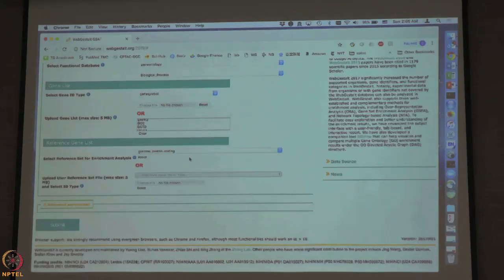So for a lot of proteins you didn't have the opportunity to get the statistics, and then you should limit your search space, or the background reference space, to those proteins you can actually analyze. This is very, very important. I review a lot of papers, and in a lot of proteomic studies, they use all the genes in the proteome as a reference. That is not correct, because you can easily identify, for example, ribosome or those types of highly abundant proteins as enriched, but it's just because those proteins have a better chance to be detected, not because they are differentially expressed. Just be careful in selecting your reference gene list.